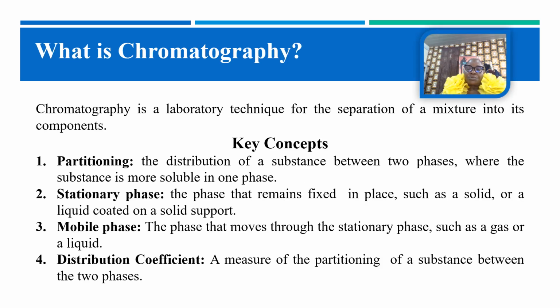What is chromatography? Chromatography is a laboratory technique for the separation of a mixture into its components. The theory of chromatography is based on the principles of differential partitioning of substances between two phases, a stationary phase and a mobile phase.